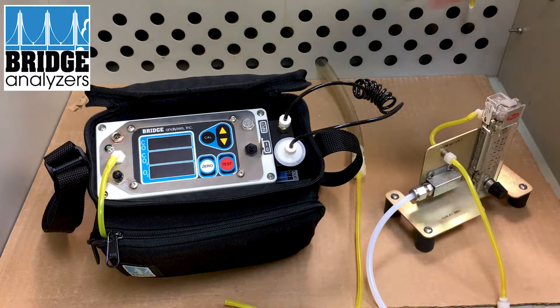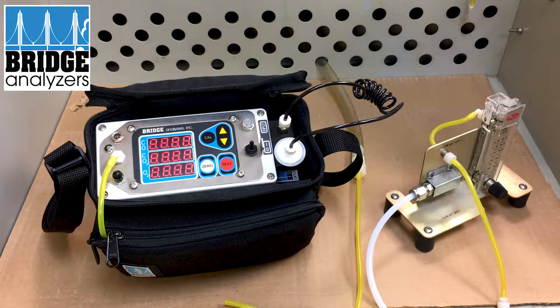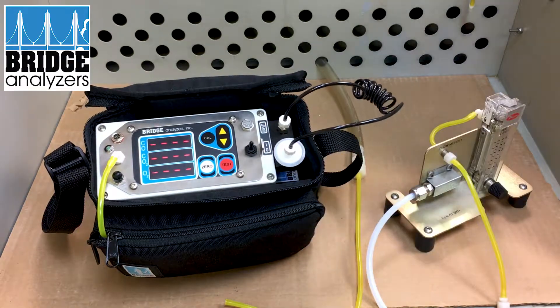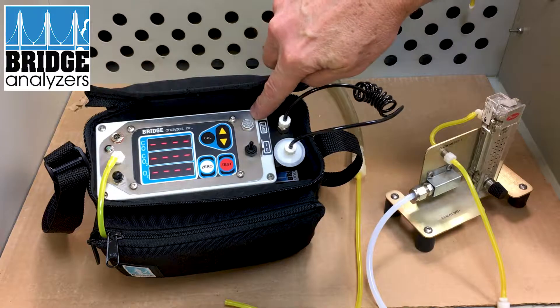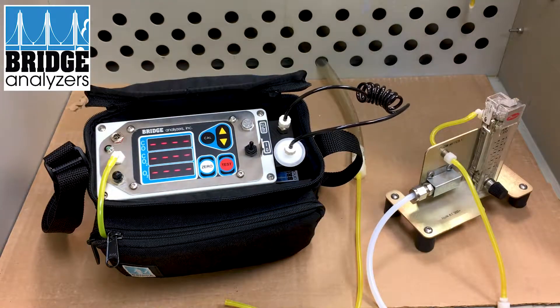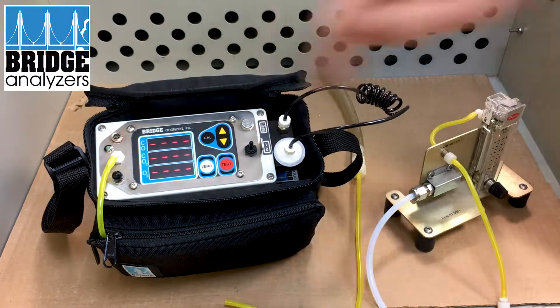When you go to calibrate, you want to turn the analyzer on. You'll see all eights and then dashes, and then when you press the zero button, you hold it until it blinks between dashes and blank. It'll run a zero process where it's drawing gas through the zero port — not the needle port — and exhausting out through the exhaust here.